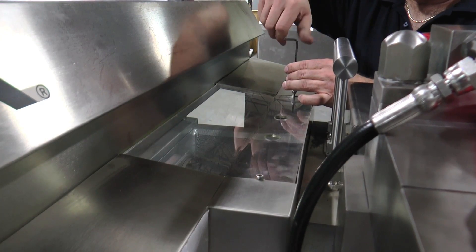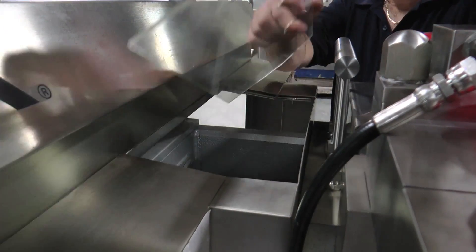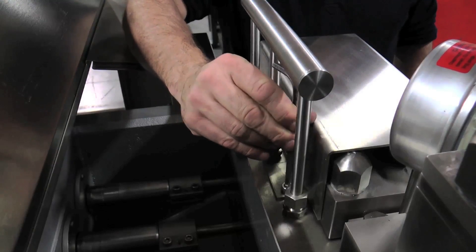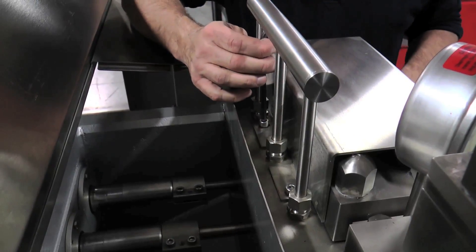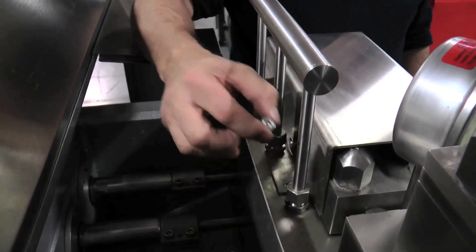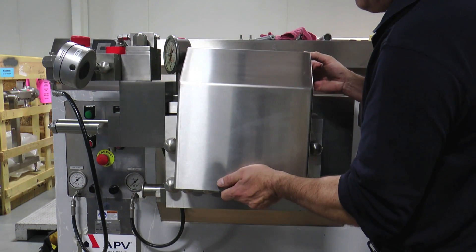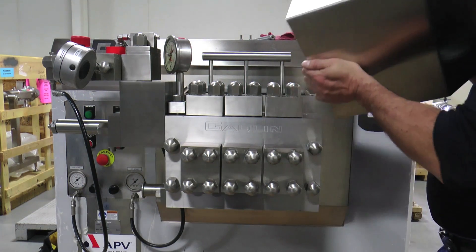Remove the plastic cover over the plunger well by removing the two socket head cap screws and lifting the cover out of place. To remove the front safety shroud from the cylinder block, remove the two socket head cap screws that hold the shroud in place. Once removed, the shroud can be lifted and pulled forward, exposing the top and front caps for maintenance access.